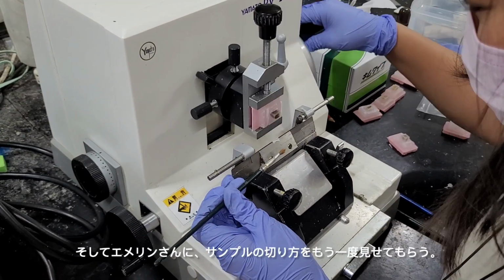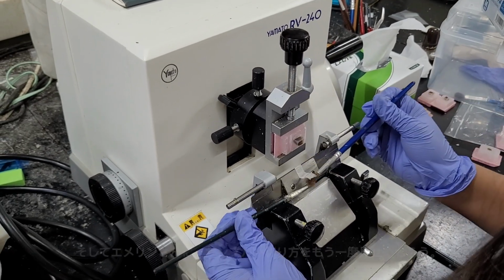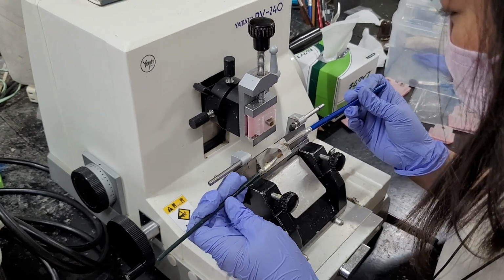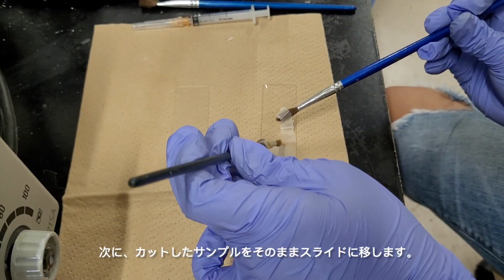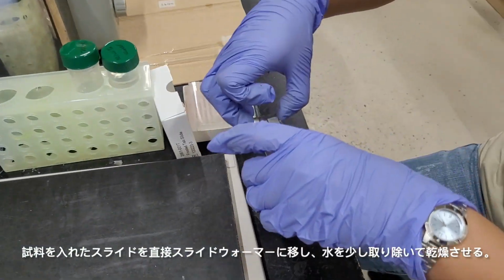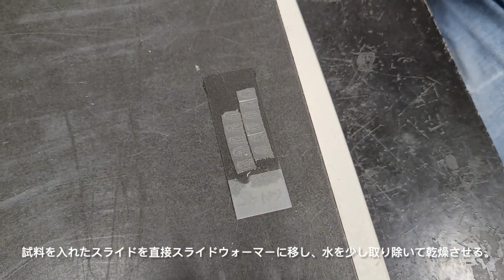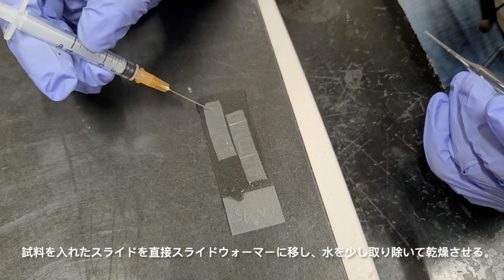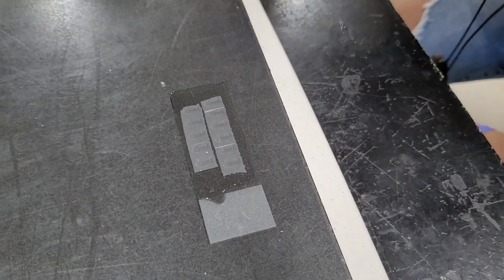So once you've prepared the slide, Emmeline-san will show us again that you have to cut the sample and then transfer that directly onto the slide. And then move the slide with the samples on it directly to the slide warmer, and we will begin to start removing some of that water, making sure that the sample is in the right position and letting it dry.